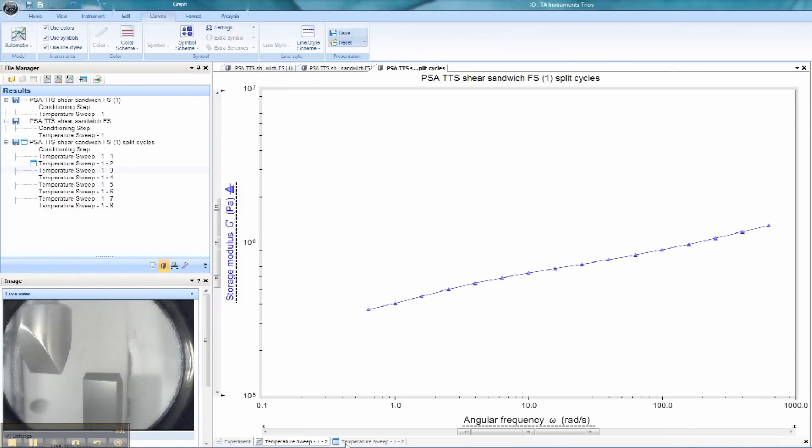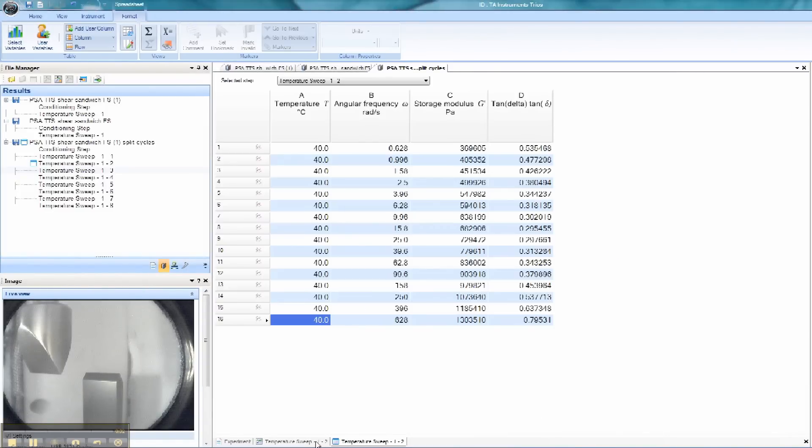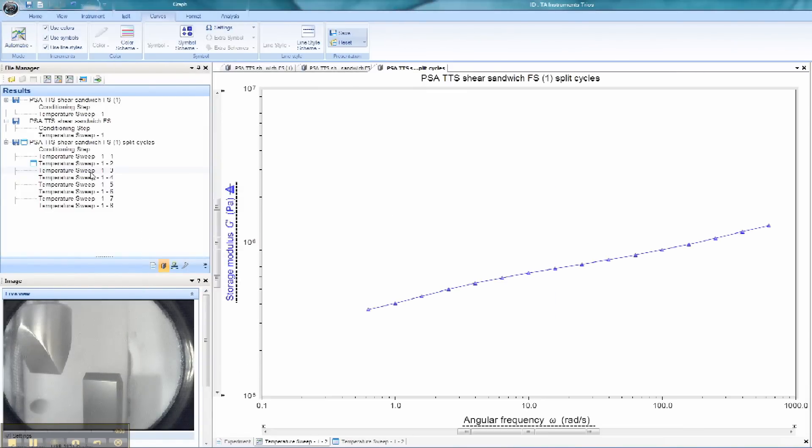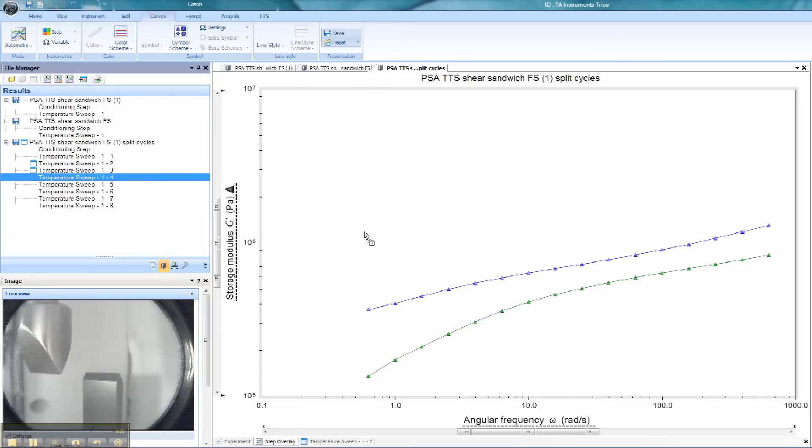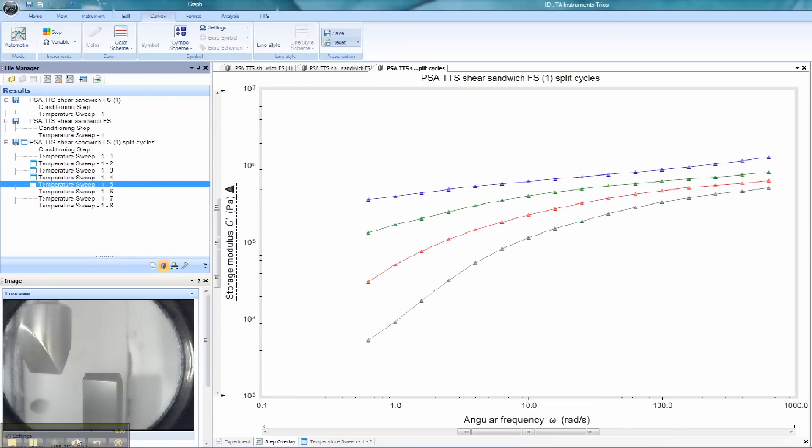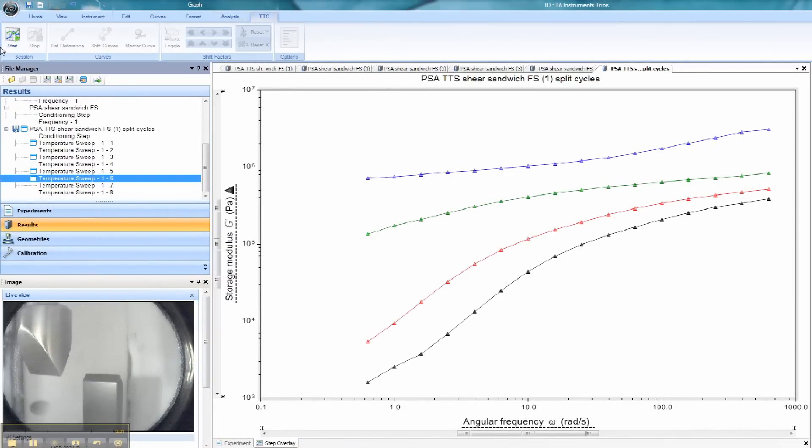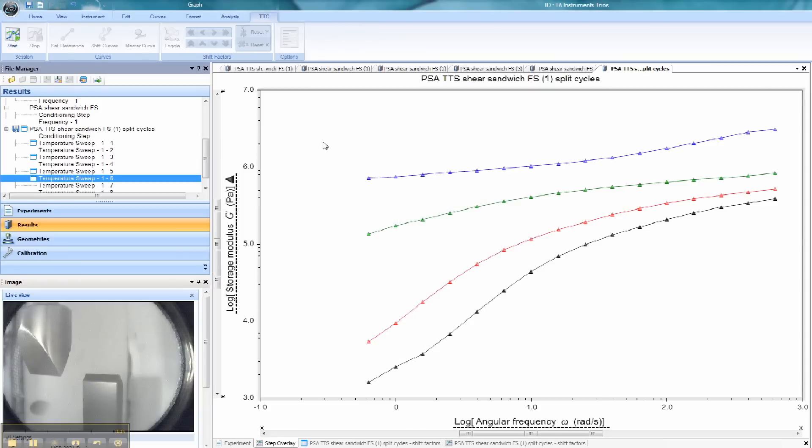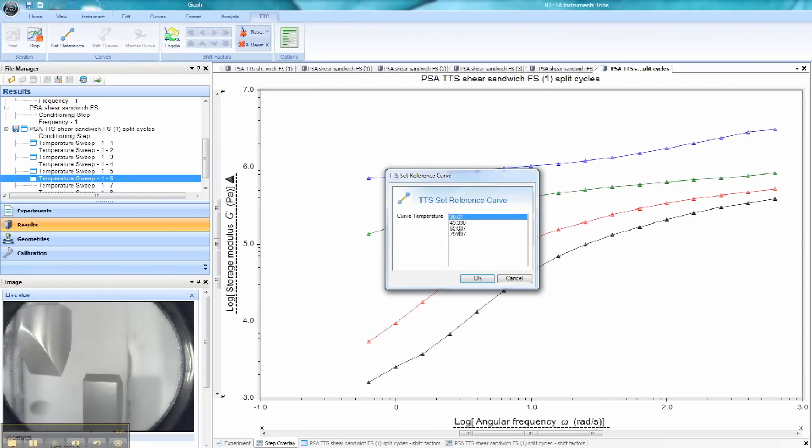TRIOS software allows you to easily switch between tabular and graphical data. Overlay plots are easily created by dragging and dropping experiment results into the result display area. TRIOS comes standard with a wide variety of data analysis options, including the popular time-temperature superposition for master curve generation.